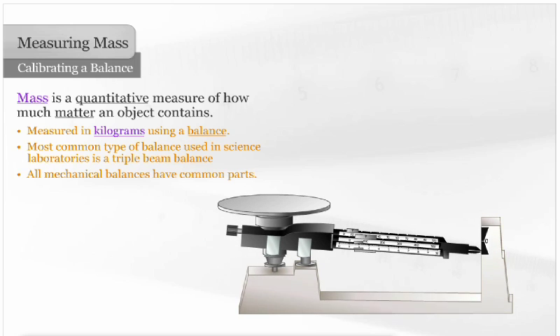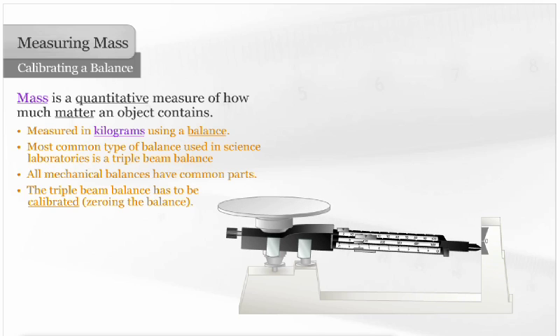In order to make accurate measurements, the triple beam balance has to be calibrated before determining the mass of an item. This process is called zeroing the balance.